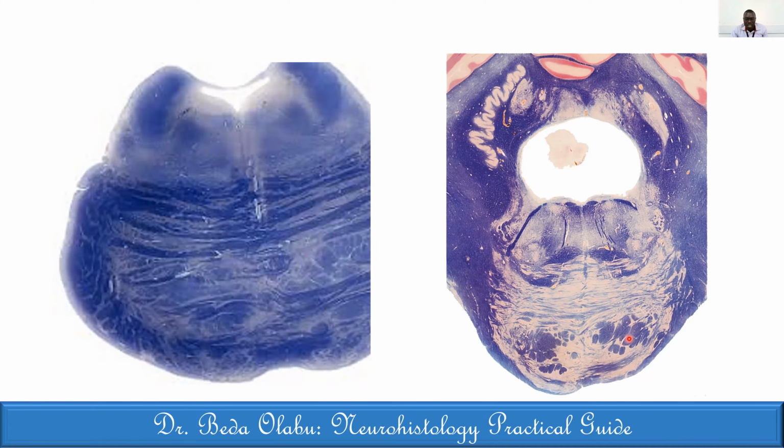The third component found in the basal pons is some nuclei found within the transverse fibers. You need a high amplification to see that. Those are the pontine nuclei. So remember, the pontine nuclei are part of this big system from the cerebral cortex to the pons to the cerebellum, the cortico-pontocerebellar fiber system.